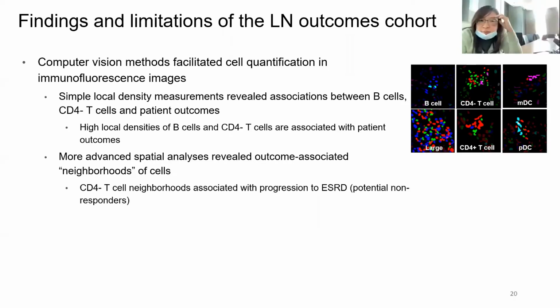So that's cool. I like the idea is basically you define the neighborhood based on the spatial information. But have you thought about, if you analyze the gene expression data, we can also define the neighborhood based on transcriptomic variation, right? So do you have any insights if you integrate the spatial transcriptomic data, how you merge the variation from the neighborhood, like similarities between the gene expression level and the spatial level?